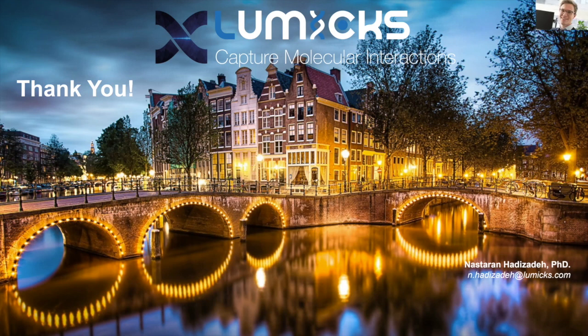I guess his follow-up question is, is it possible to do high throughput experiments in the C-trap setup, or is it always one molecule at a time? Well, it's always one molecule at a time, but in terms of doing it in a more efficient way or doing it faster, as I mentioned, you can automate everything in the software. So it would still be one molecule at a time. Depending on your experiment, you might have multiple DNA attached to the beads, but it would be one at a time, because you only have 2 traps, right?